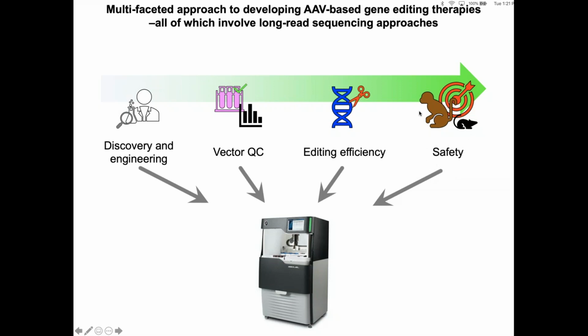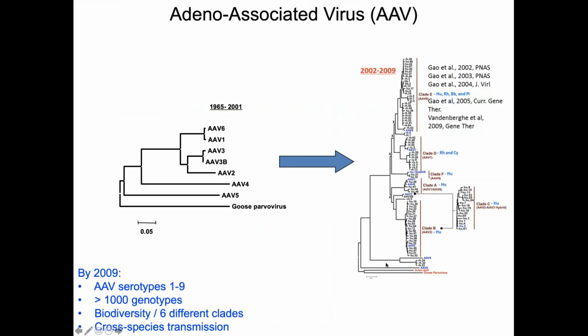A lot of the work that we do is carried out in preclinical non-human primate studies or in mice. And what I'm proud to say is that a lot of these different aspects of our studies are dependent on long-read sequencing technologies. So what I'd like to do is focus my time and discuss how we've been using PacBio sequencing for our studies related to developing gene therapy tools.